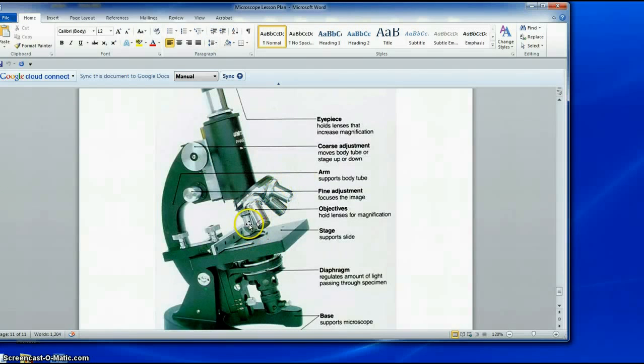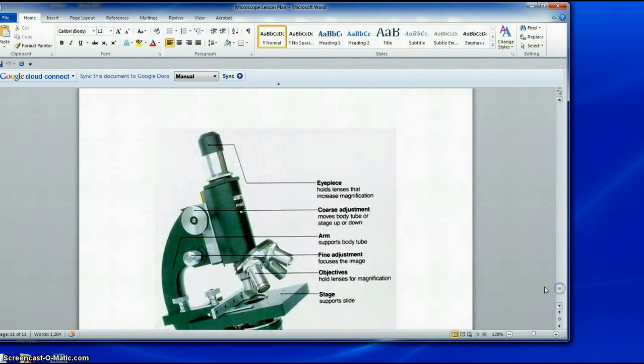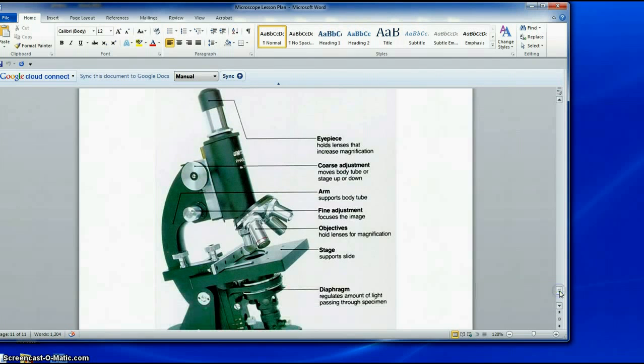Notice there are several lenses. The most powerful is the longest, and the power of a microscope is determined by multiplying the magnification of the ocular lens, which is held by the eyepiece or the eyepiece tube, and it is usually 10x, but some are 15. I prefer 15, and I buy for myself an eyepiece that is much wider because of my glasses. It's easier to use for me. Or eyepieces in the case of a binocular head, which I prefer, of course.